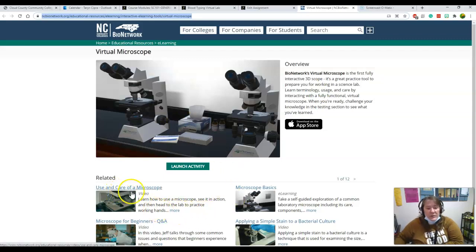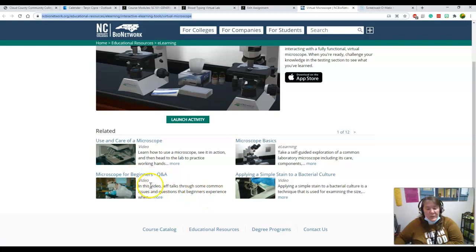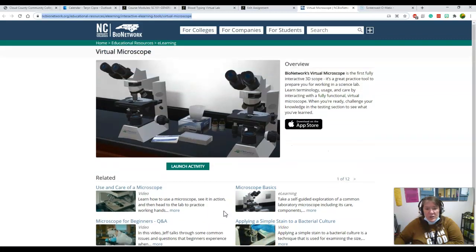So there's little videos down here like microscope basics, using care of the microscope, microscope for beginners, questions and answers. And there's even an example of applying a simple stain to a bacterial culture. So all of those videos are super useful if you want to learn the parts of the microscope, which we will be doing in class. So those videos are recommended.